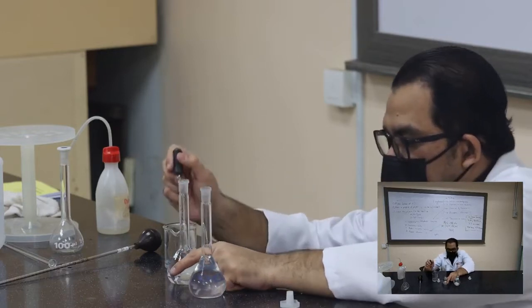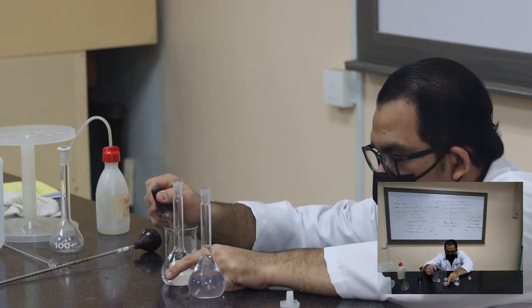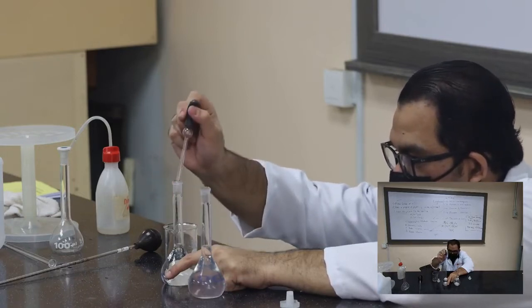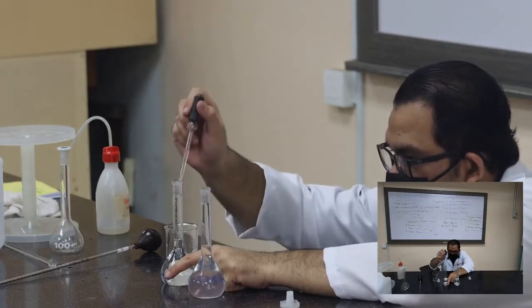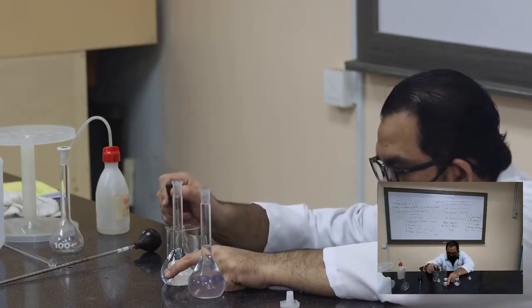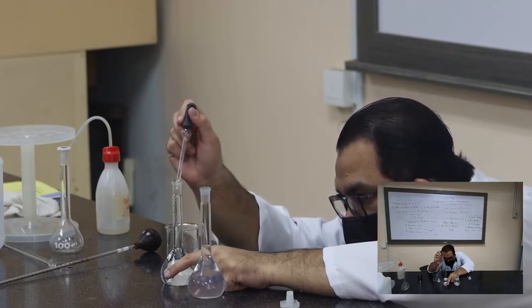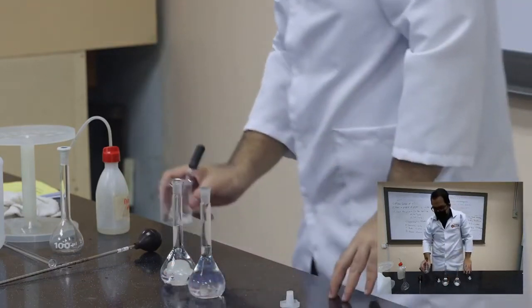Alright, just pipette a little bit more to make sure that we get to the mark. Okay, a little bit more, maybe a little bit more. I think a few more drops maybe. Okay, a little bit more. Carefully, make sure that you get the meniscus right to the mark. Okay, I think I got it.